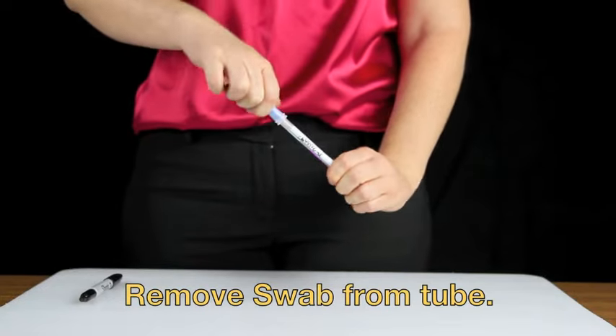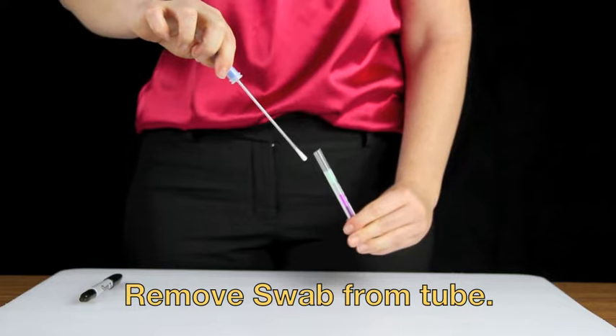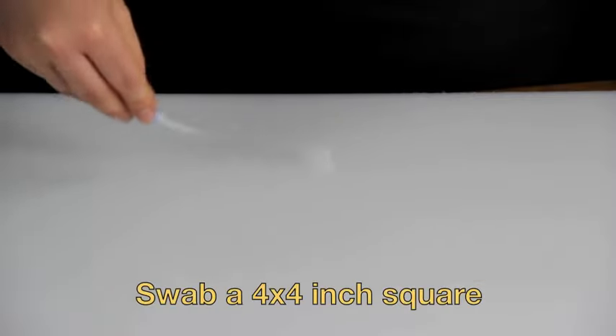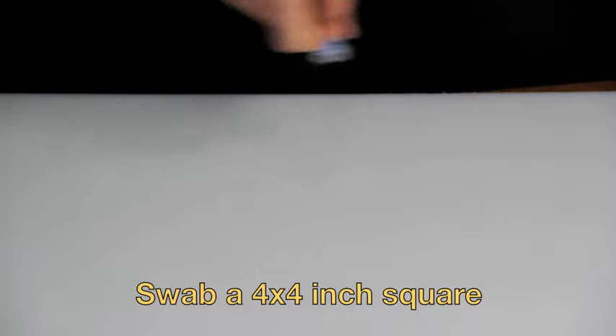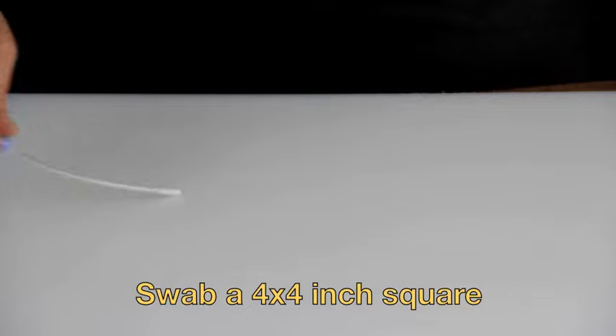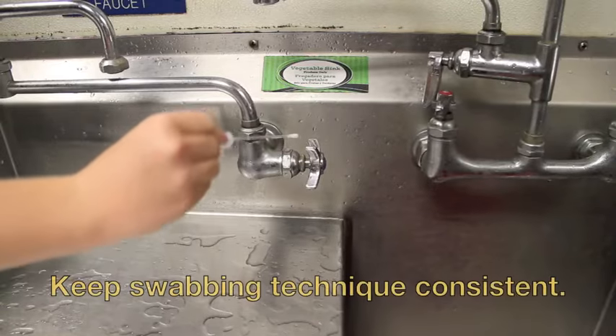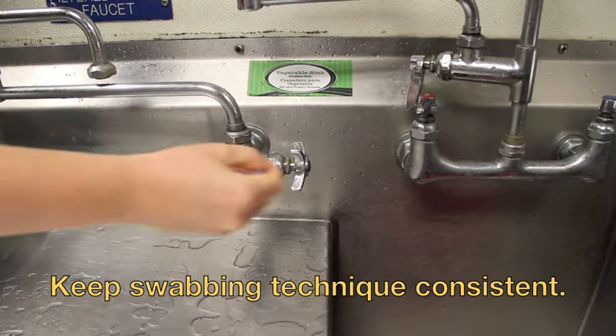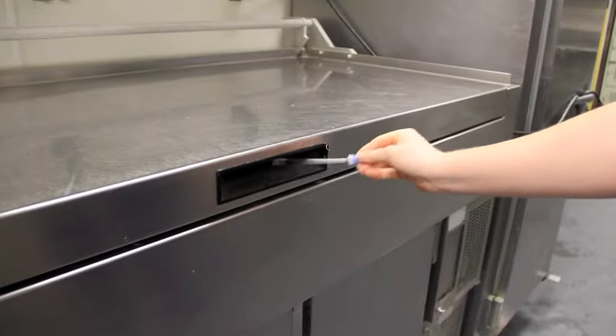Holding the swab tube, twist and pull the swab out of the tube. Swab a 4x4 inch square area, making a criss-cross pattern, applying sufficient pressure to create flex in the wand, and rotating to collect sample on every side of the swab tip. For irregular surfaces, ensure the swabbing technique remains consistent for each swab and sample a large enough area to collect a good sample.